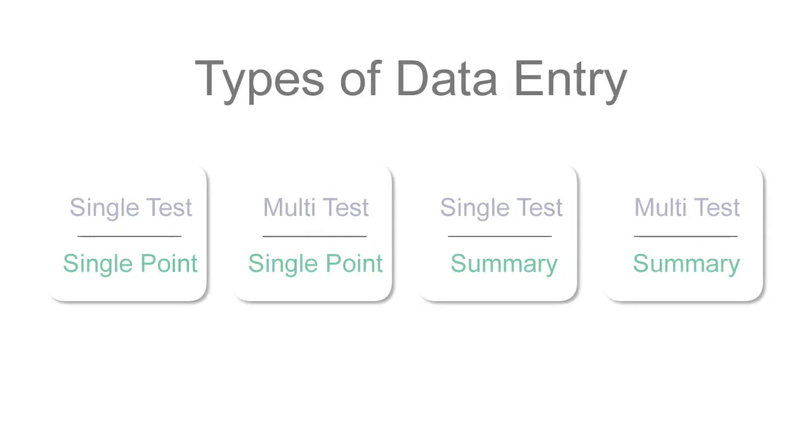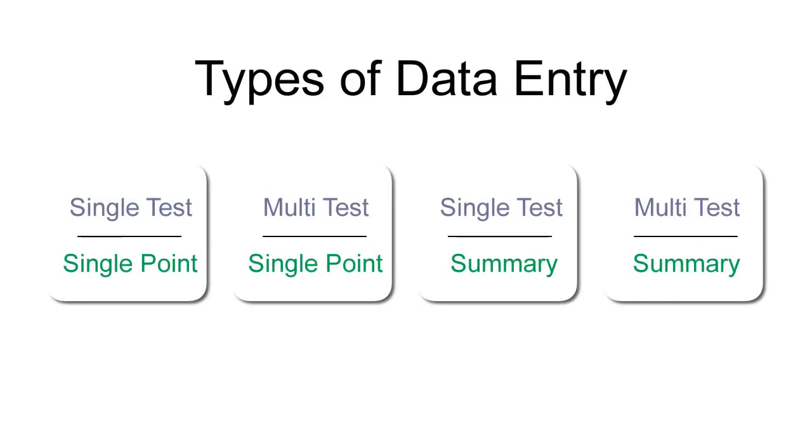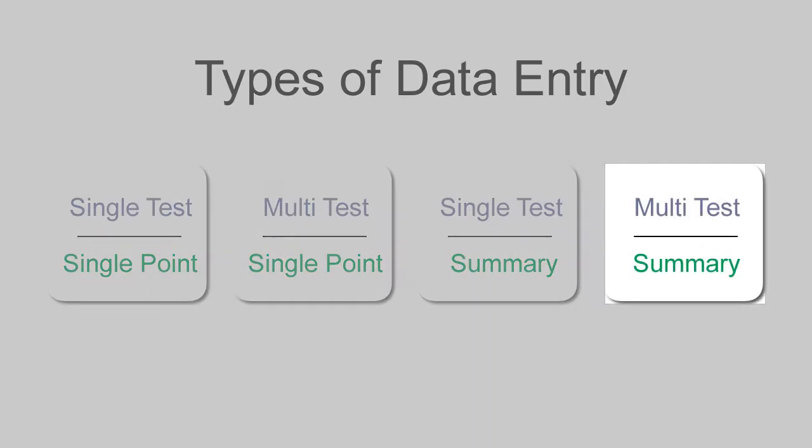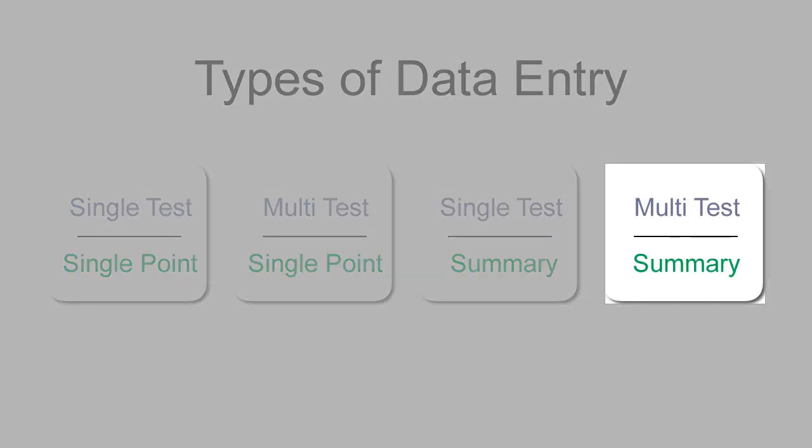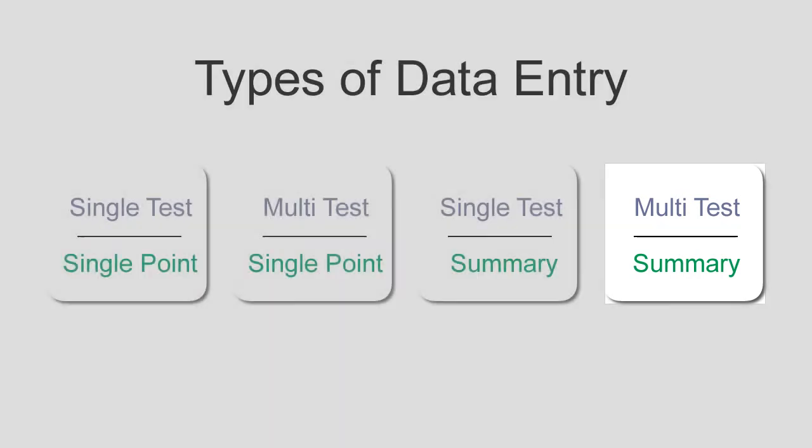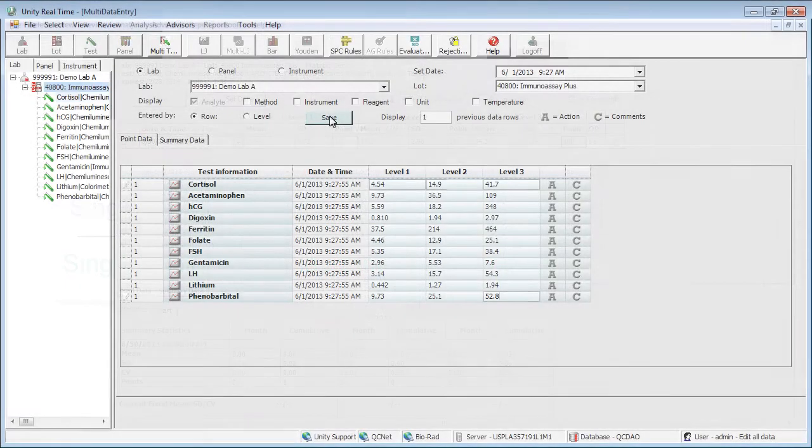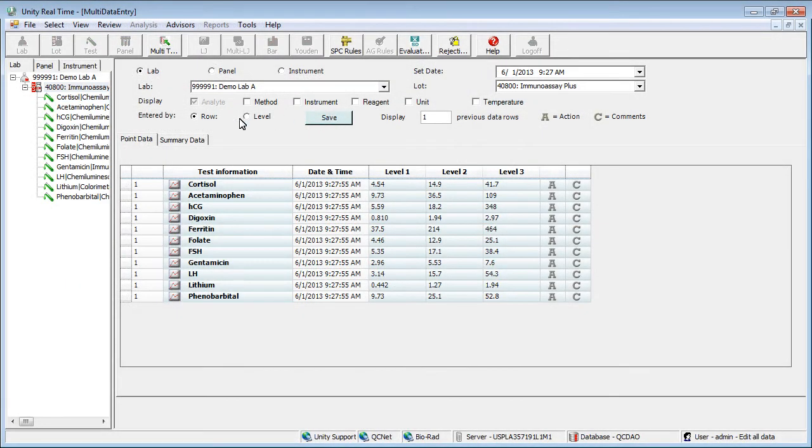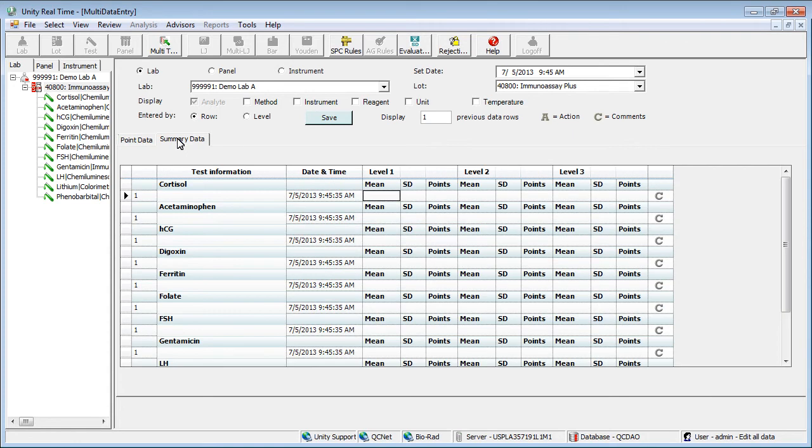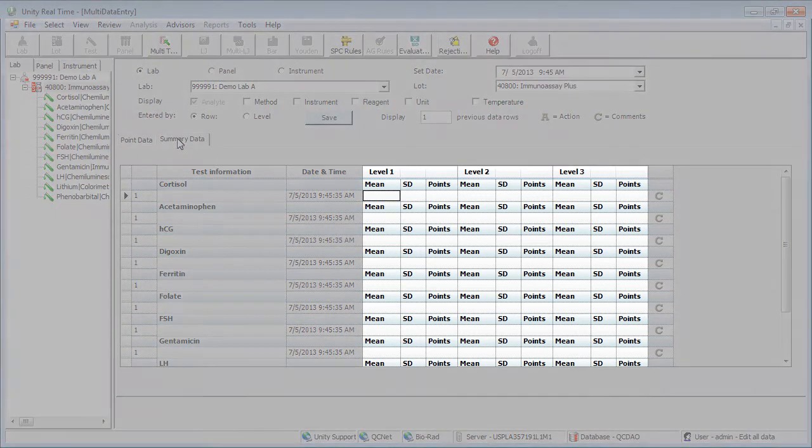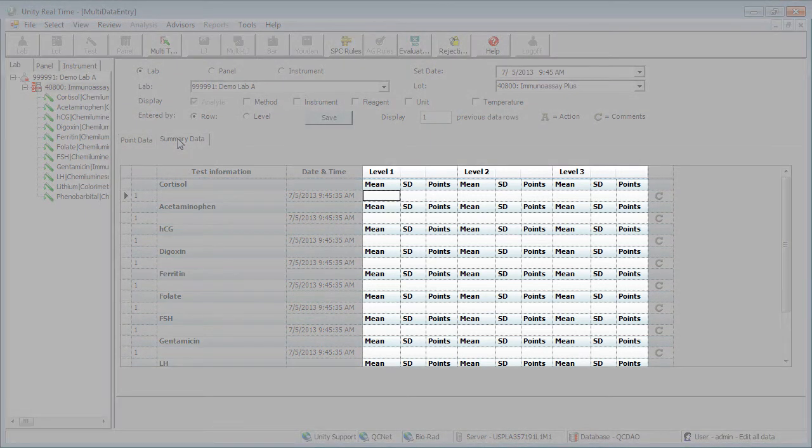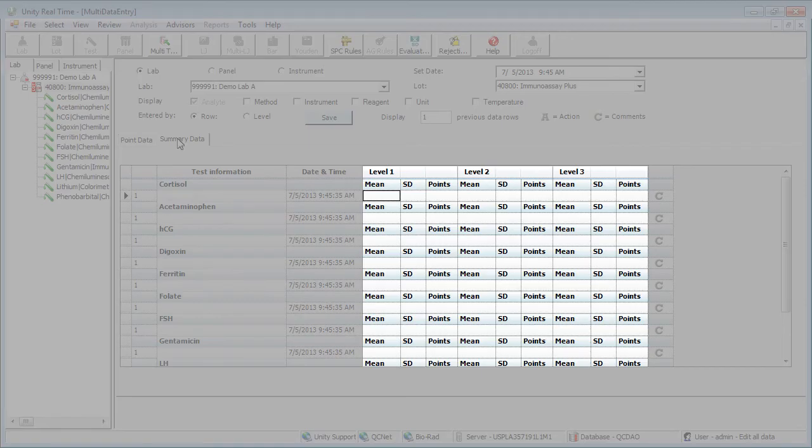Finally, let's take a look at entering summary data for multiple tests by returning to the screen where we left off. Click the Summary Data tab. The layout is similar to the last multi-test approach. The difference is that here you can enter the mean, SD, and number of points for each test.